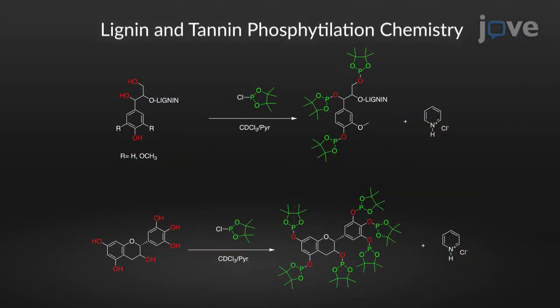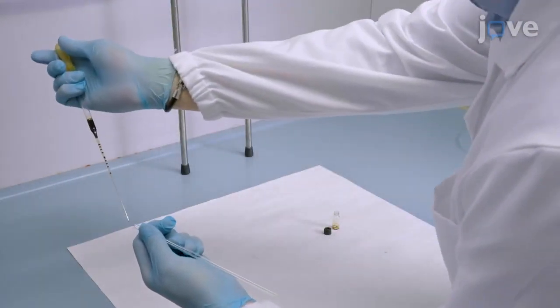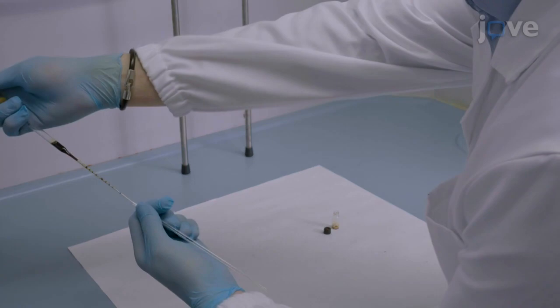At this point, the indicated reaction occurs on the lignin and tannin samples. Using a Pasteur pipette, transfer the sample solution into an NMR tube.